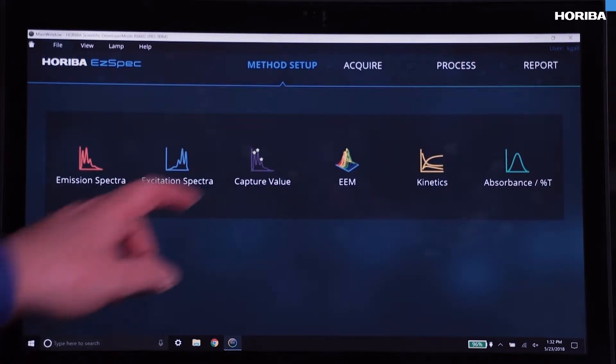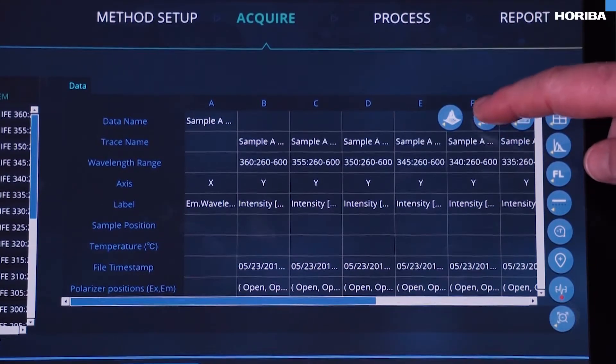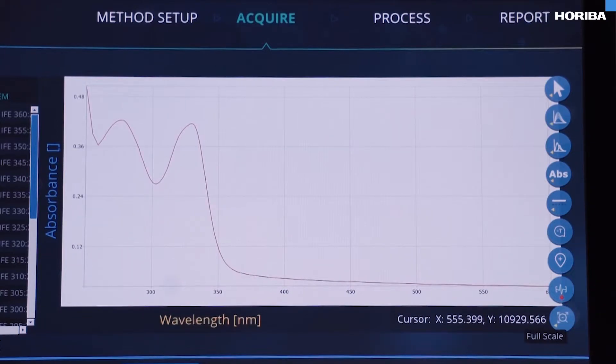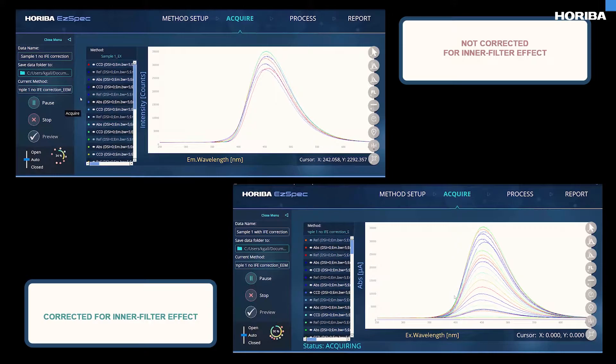The fluorescence absorbance dual nature of the Duetta is unique. You no longer need two instruments in the lab. And now we can correct the fluorescence dataset for the inner filter effect, the IFE, to give a truer molecular fingerprint independent of concentration.